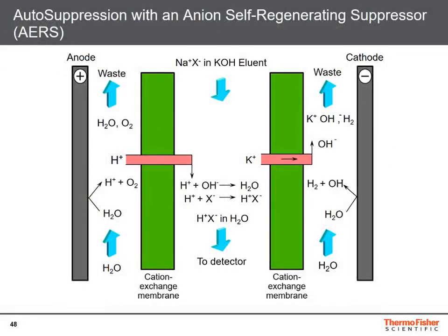We have heard about the various types of suppressors and their impact on conductivity and mass spec detection. Let us now have a look into the inside of such a suppressor and how it works. As an example, this slide shows the schematic of an anion self-regenerating suppressor.